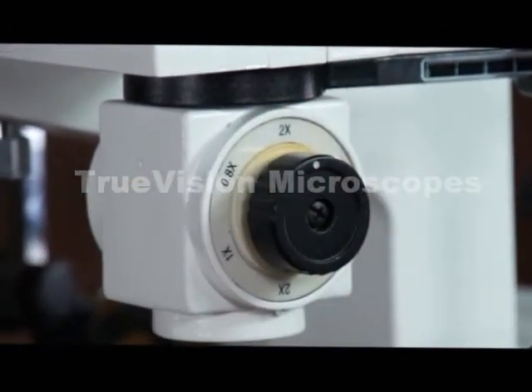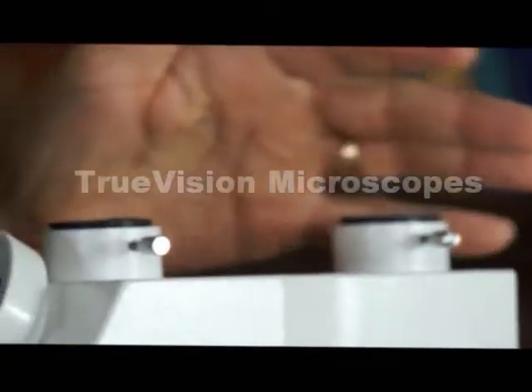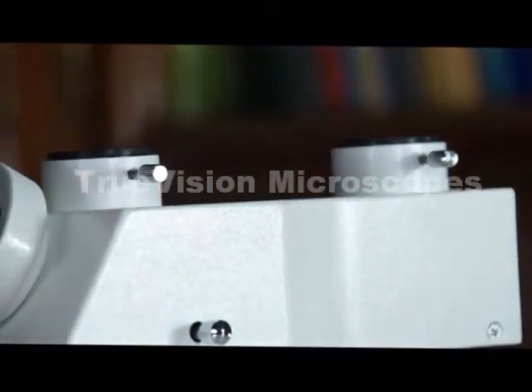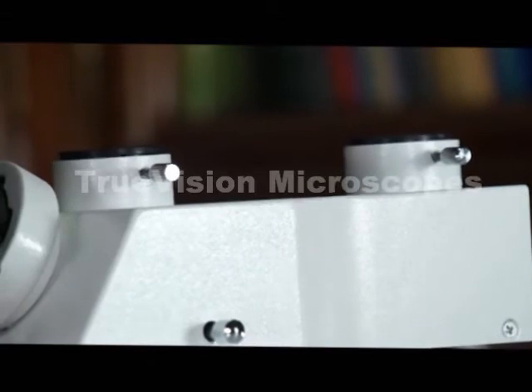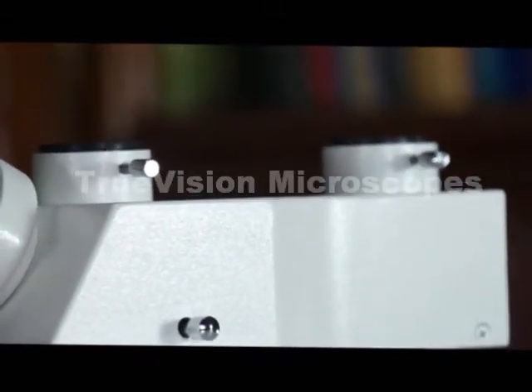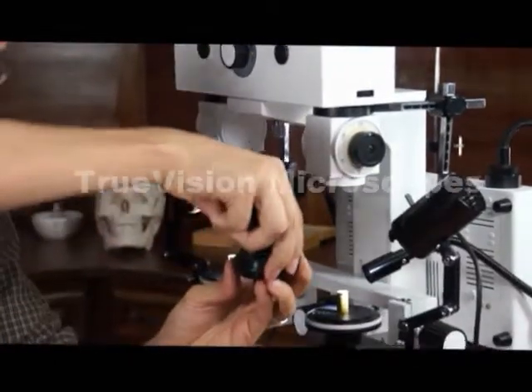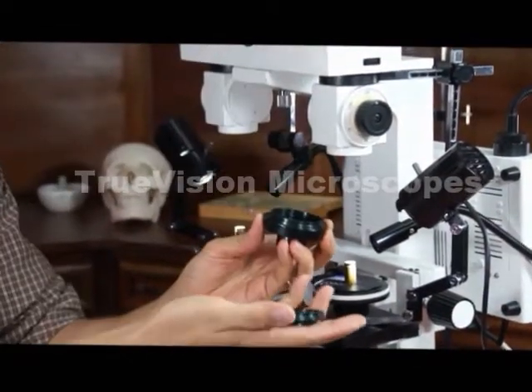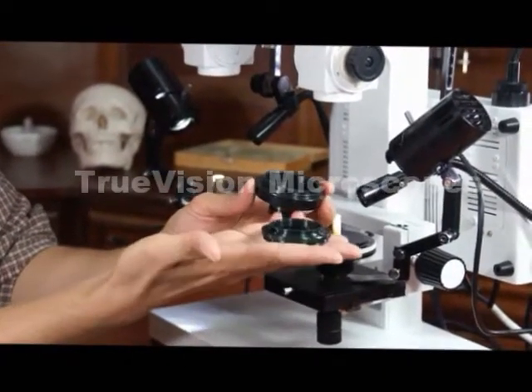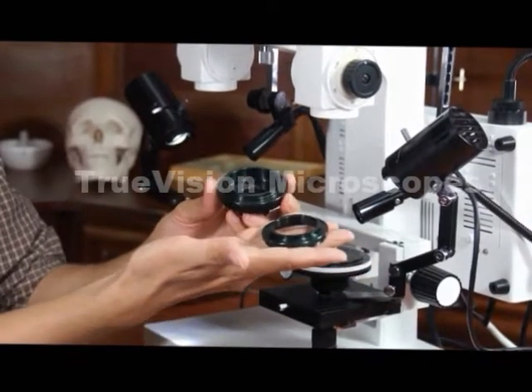This particular version has two photography ports. The back port is for SLR cameras. This is the SLR adapter. On the top is a T adapter. This is another version of a T adapter. Depending on which type of camera you're using, you're going to have to have the T adapter to match that camera.